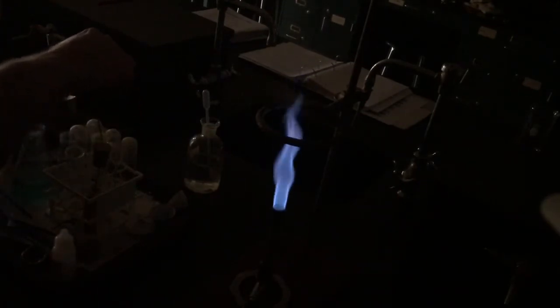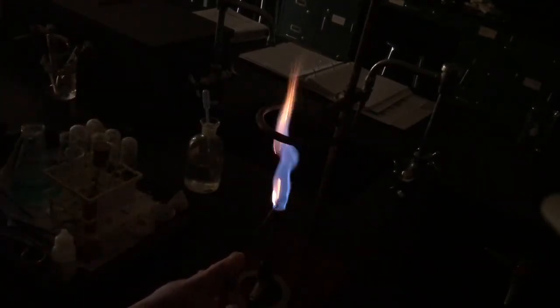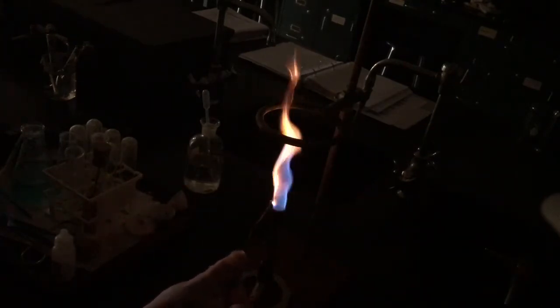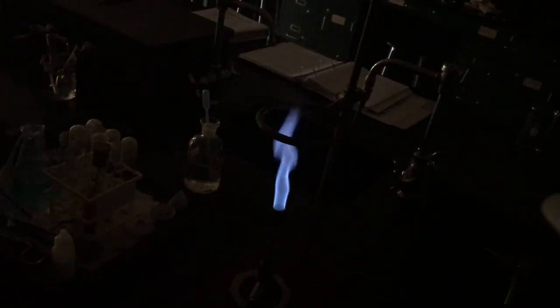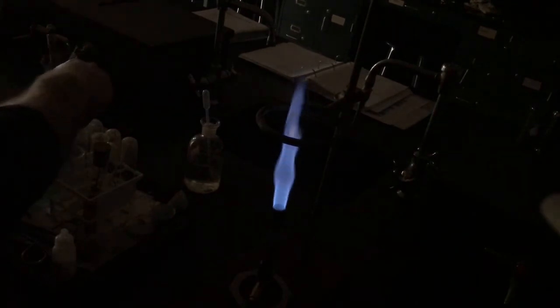So what we're going to be doing is looking at different colors of flames. Okay, yeah, there we go. That's a good one. So we clean it like that. The first one we're going to look at is sodium. Okay, so sodium should burn like this.